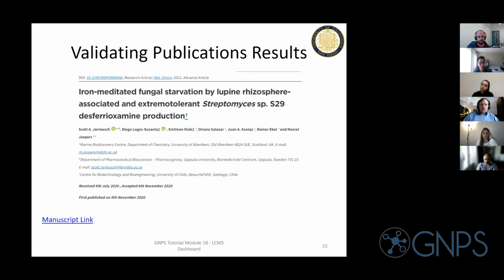Then going up the food chain, whenever you're getting ready as a PI for publication, you want to check the data. Right now it might be a little bit cumbersome, but with the dashboard, hopefully it makes it easier to go all the way from the final result down to the specific peaks that are of interest. So kind of sharing within the lab.